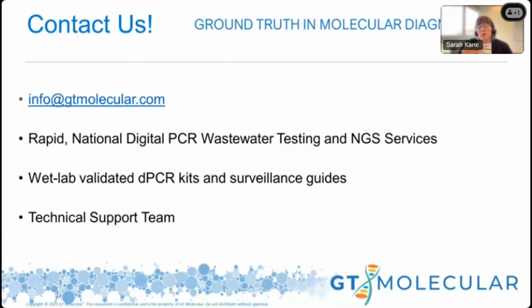So what we envision moving forward is adding in both A and B particles at the beginning so that we can concentrate potentially everything. But again, the question is at that point when we have to split up the concentrate and do extraction by bead beating under one condition and then MagMax or Qiagen extraction on another. So yeah, David, please feel free to reach out and let me know if there's anything else that you want us to try. I would be very interested to hear about your results as well.